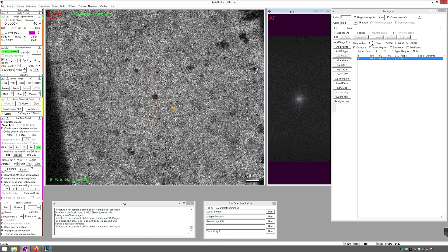The accuracy you're looking for here is the correct side of a square. So if I press the center, I'm in the center, not in a corner.